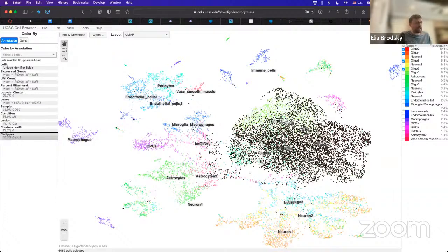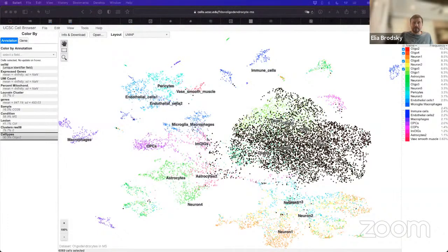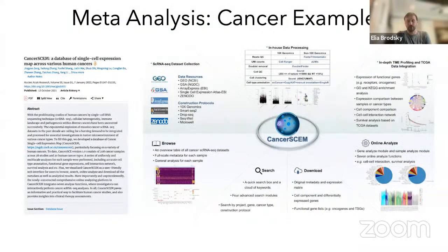Obviously, there are many different types of neurons. Okay, so the next thing that we want to look at is some examples from disease. Okay, so here we saw these are healthy tissues. Now let's look at disease. So this is a collection of data that was taken from all of the possible data sets that are available on tumors.